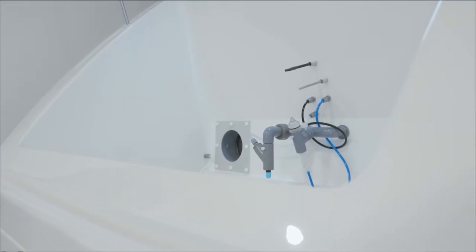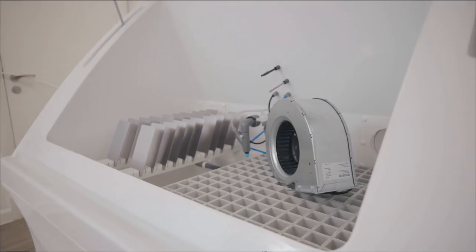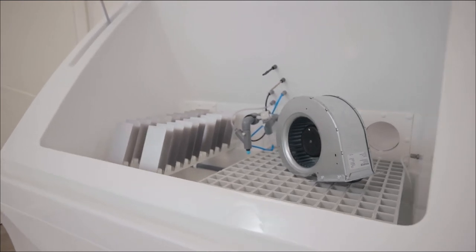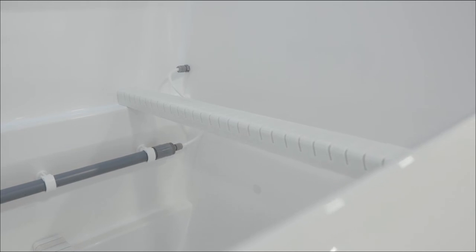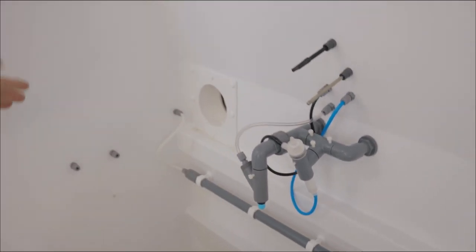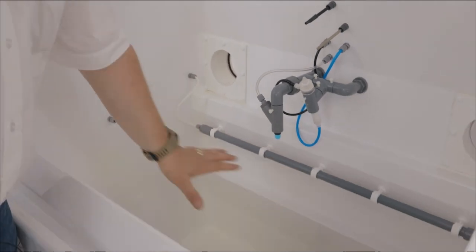We have a low loading threshold which makes it very easy for lifting heavy samples into the chamber without placing any stress. We have two levels: the high level rack position and low level rack position. We also have an optional accessory which allows you to place items on the floor of the chamber.